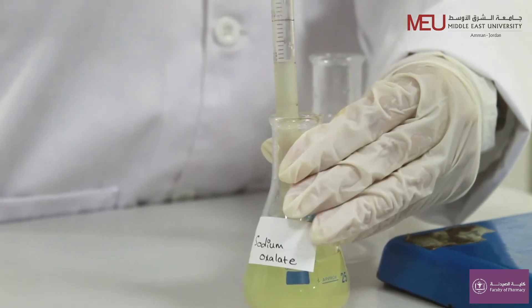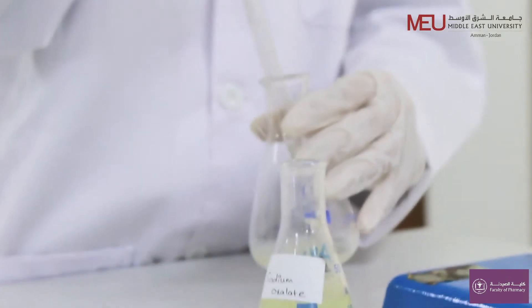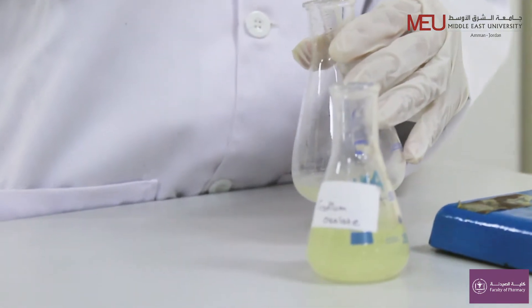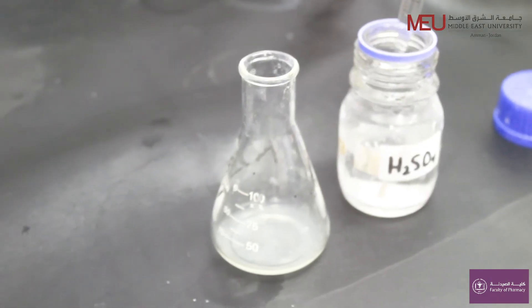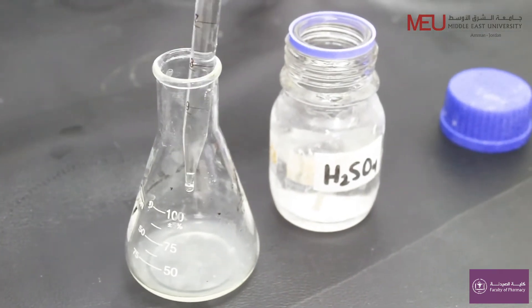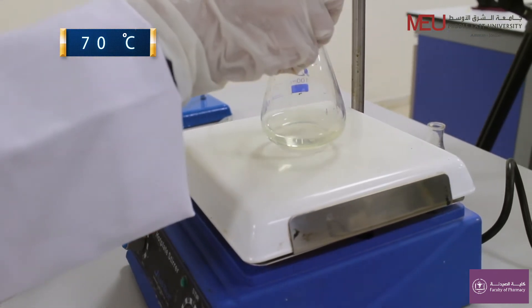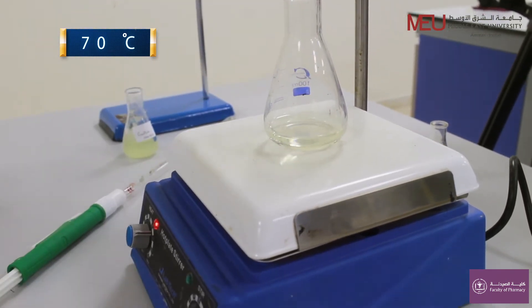Add 10 ml of sodium oxalate into a conical flask. Add 10 ml of 10% H2SO4 — you will find it under the fume hood. Heat to above 70°C to speed up the reaction, so we start heating using a hot plate.